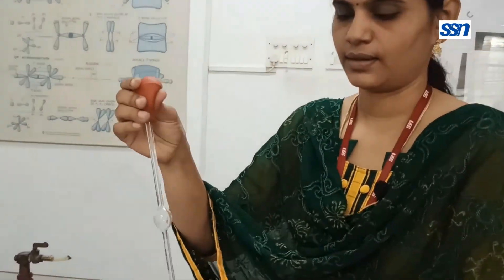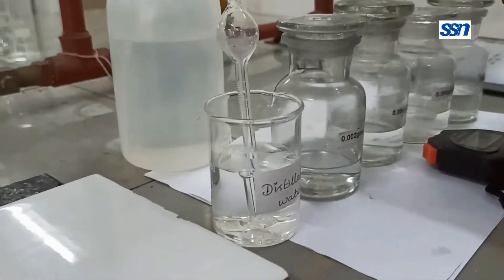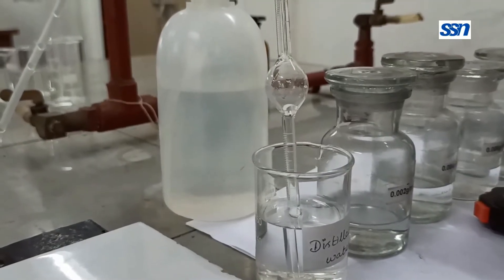Let us get started with the experiment and I will give you a stepwise procedure on how to proceed. The first step is to determine the efflux time for the solvent. The solvent we have taken here is distilled water, and the polymer is dissolved in distilled water. You take the viscometer, place it inside the beaker, and suck the solvent inside the viscometer.